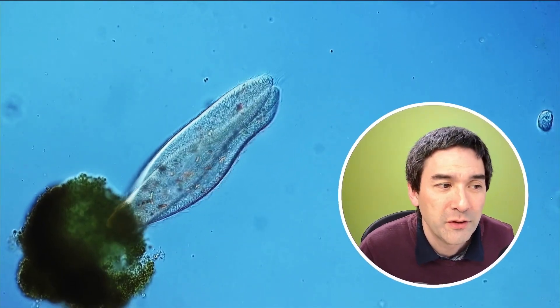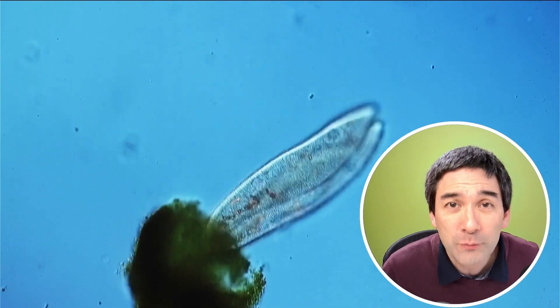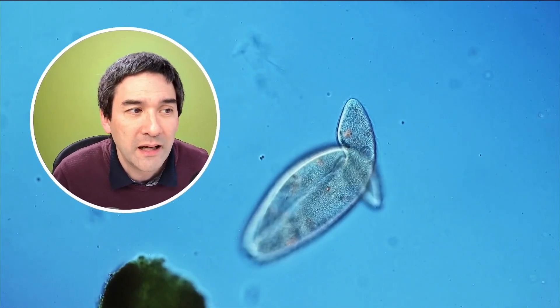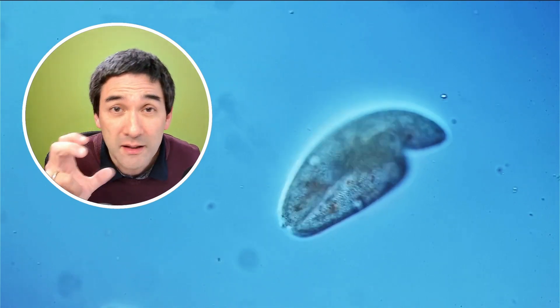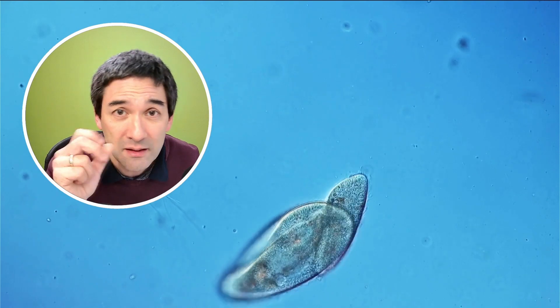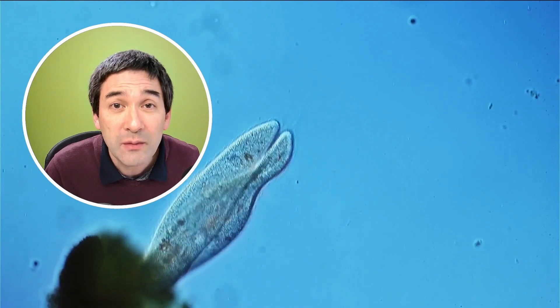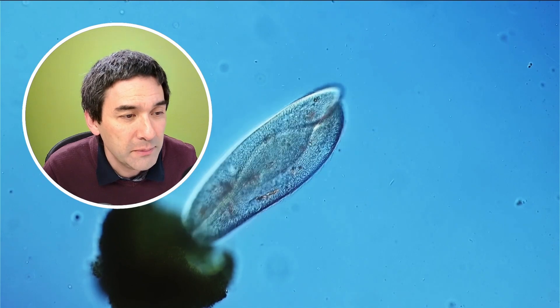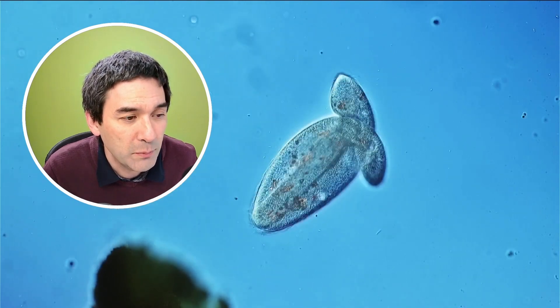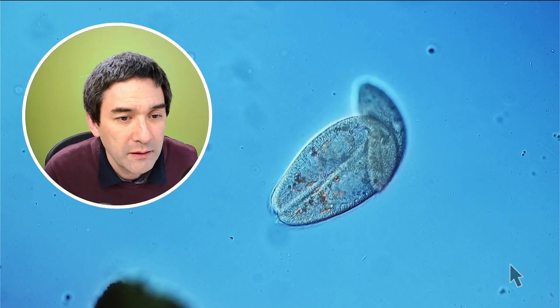A little bit larger over here. You can see it's bumping into this algae over here and then reversing direction. During a conjugation process, two cells will start to align with each other. Their cytoplasm fuses together — the membranes basically make a bridge. The membranes fuse, and the cytoplasm then allows them to come together. Then they will start to exchange DNA. I'm going to pause the video here. And over here with the arrow, you can see they form a so-called cytoplasm bridge between the two cells.